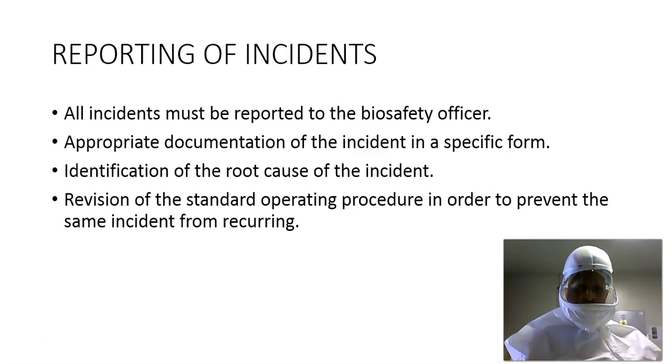Reporting of incidents. All incidents must be reported to the biosafety officer. Appropriate documentation of the incident in a specific form is necessary in order to ensure traceability. Identification of the root cause of the incident is essential in order to prevent recurrence of that particular incident. Revision of the standard operating procedure is required in order to prevent the same incident from recurring.